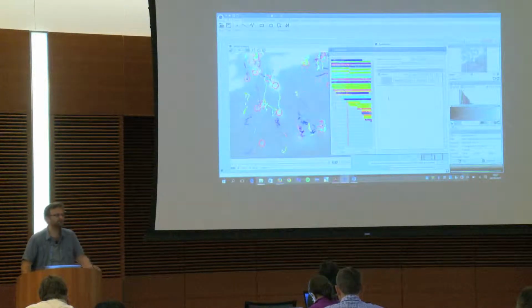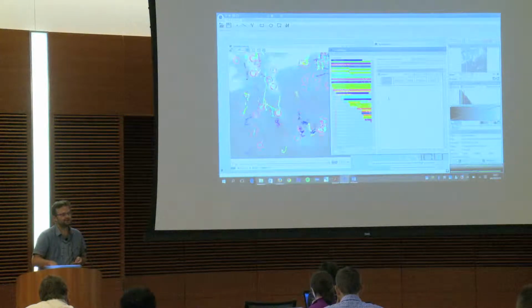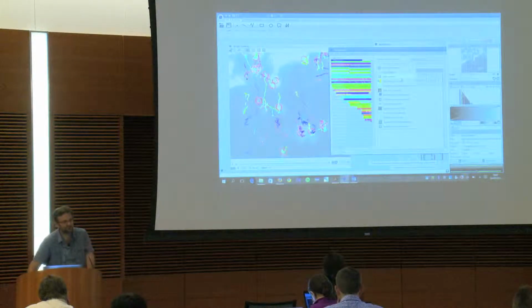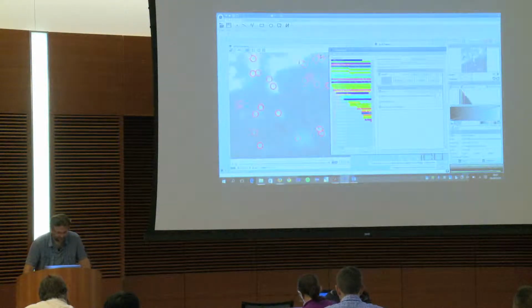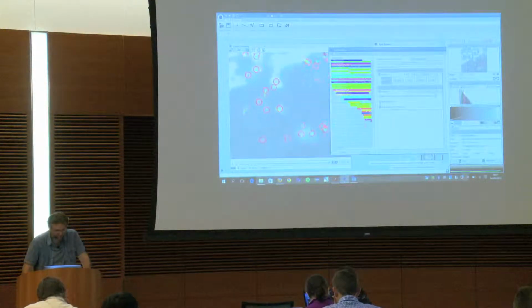So we don't want you to recode everything. We want you to be able to only write the little piece of code that is needed. So that's why here we have the tracking plugin, we have the track manager plugin, and all those things that you can add in here to monitor your tracks are plugins. So if I want to put a time clip, for instance, and now you see that the tracks, they have a tail. And you can also now display the future, so you have the current position and the future and the past.